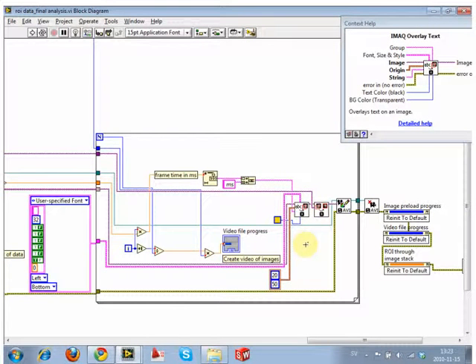With a lot of image manipulation, especially for video encoding, you can put lots and lots of things on top of images. Just like in Photoshop, they're treated as overlapping layers. It's hard to pull out any of the layers, but you can pull out the bottom image. So if I just said, save the AVI, it would not transfer over any of the overlay data. We're writing on top of an image, but when you try to manipulate anything with that image, it will just take the image. The overlays are kind of just floating around doing their thing.